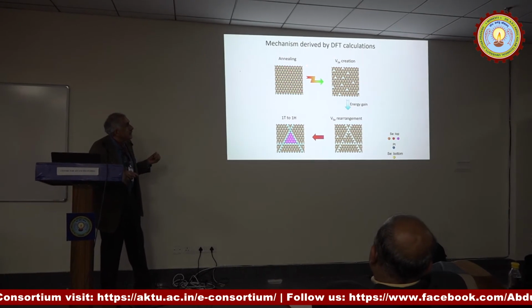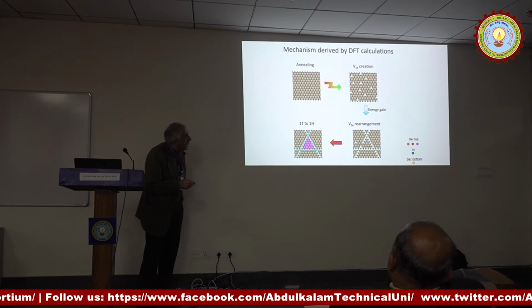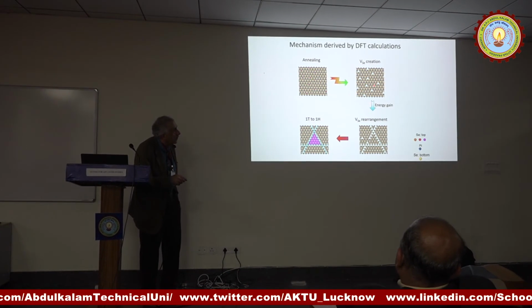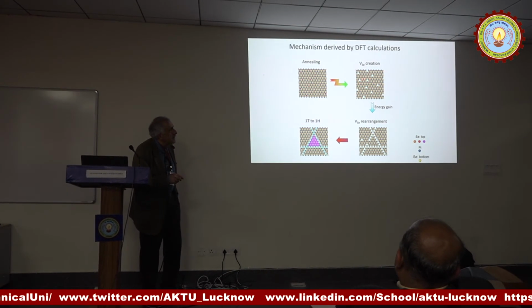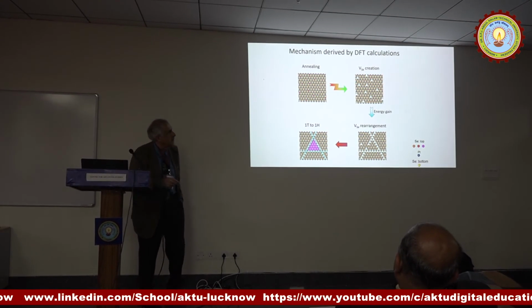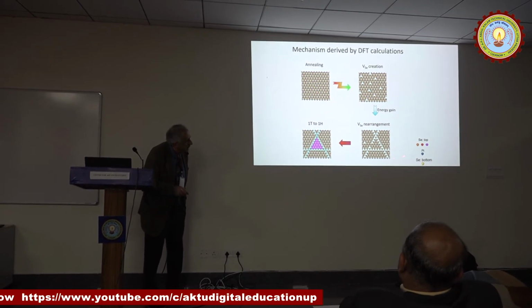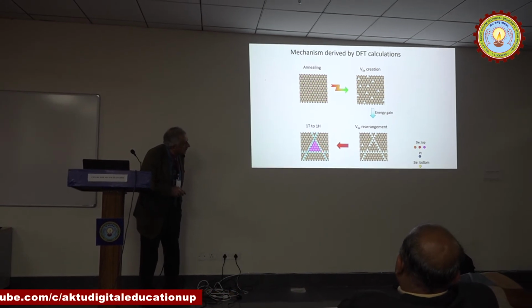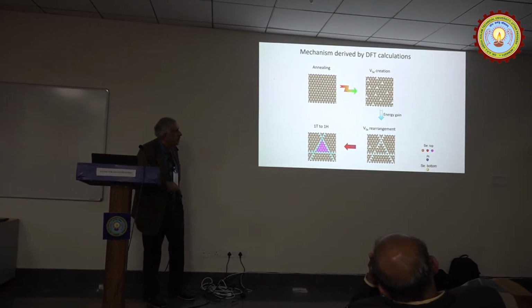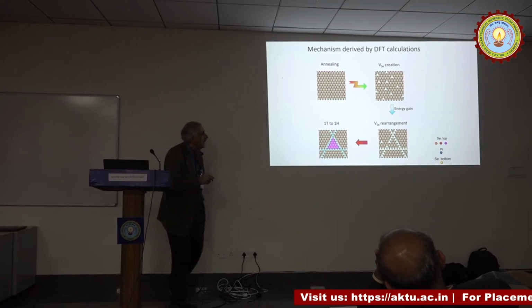When you anneal it, you lose selenium atoms. Back to the same theme, that selenium atoms come out, and we found out that if you generate these vacancies, you actually gain energy. They come off by heat, the 400 degrees. The calculation tells us that you gain energy if you arrange these vacancies in triangles. And once you have the triangles, the vacancies go to the boundaries, and then we found out when you confine the 1T structure in the triangle, it's energetically preferred to form a 1H structure. So we understand what's going on. And this thing is reversible.